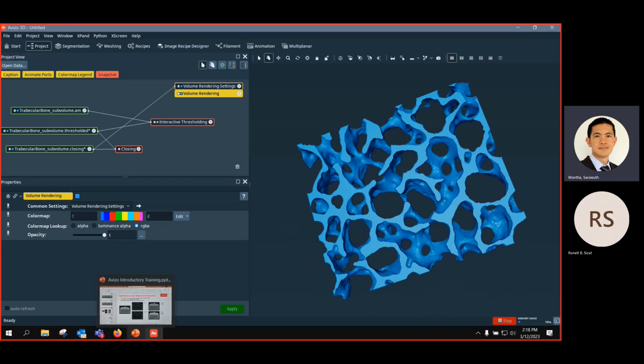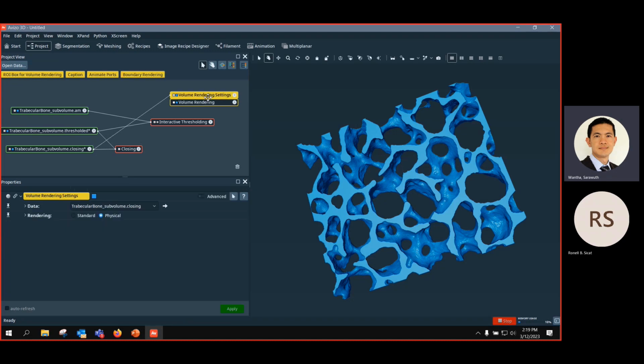So now you see that you can do dilation and erosion. It depends on the sequence. If you do dilation first, followed by the erosion, then you get closing. But if you do erosion first, followed by dilation, you get opening. And why do we have these two identical things? Because sometimes you don't want to have the symmetric closing or opening. You want to erode more than you dilate back, or you want to dilate more than the erosion. So you have two options to use. You have symmetric closing or opening, or you can do this dilation and erosion in sequence.